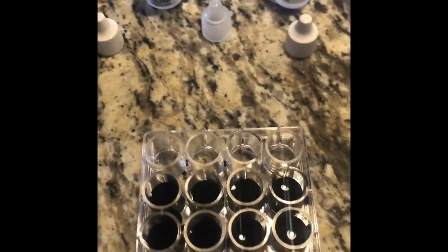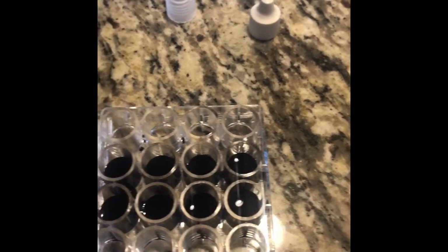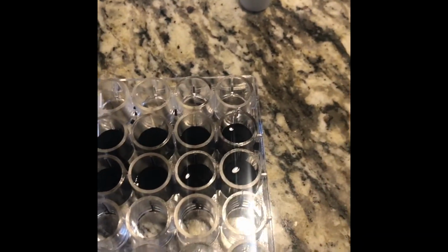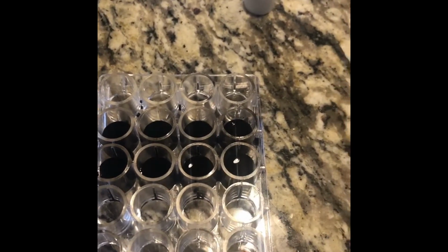I did my 8 trials. What had happened was when I put less of the hydrogen peroxide into the wells, it took longer for the color to change. And so in the same respect as the KI concentration, it decreases the rate of the reaction.